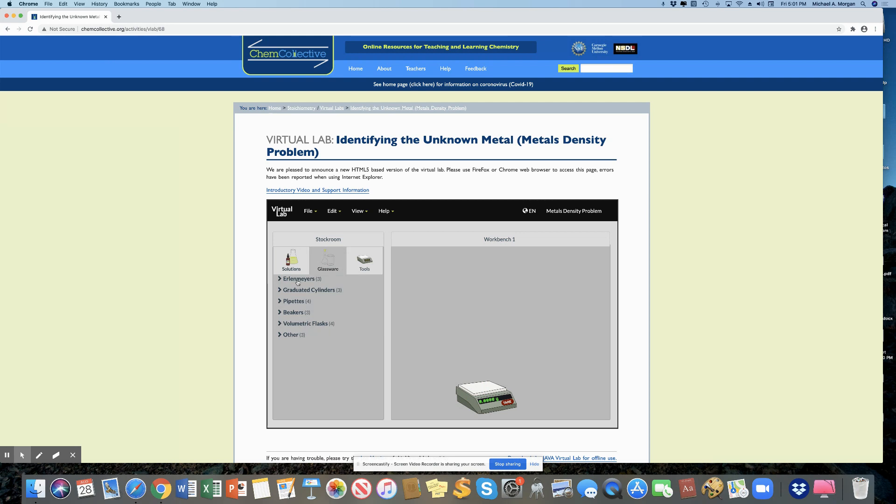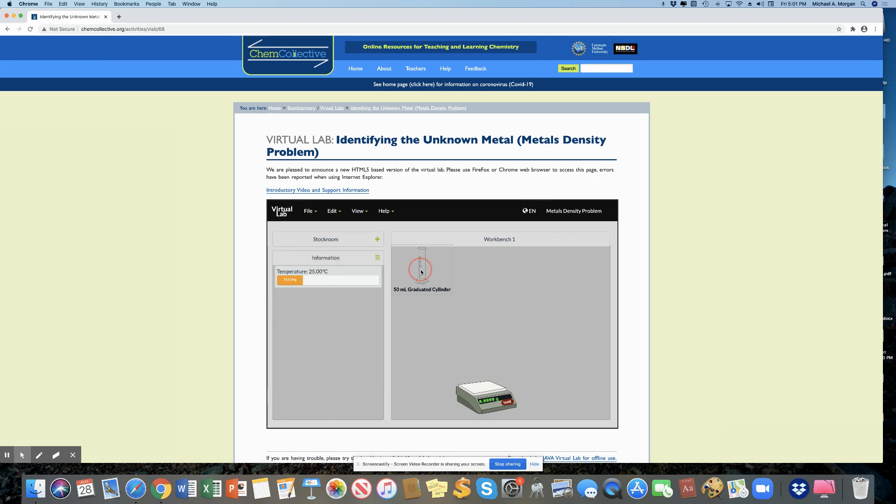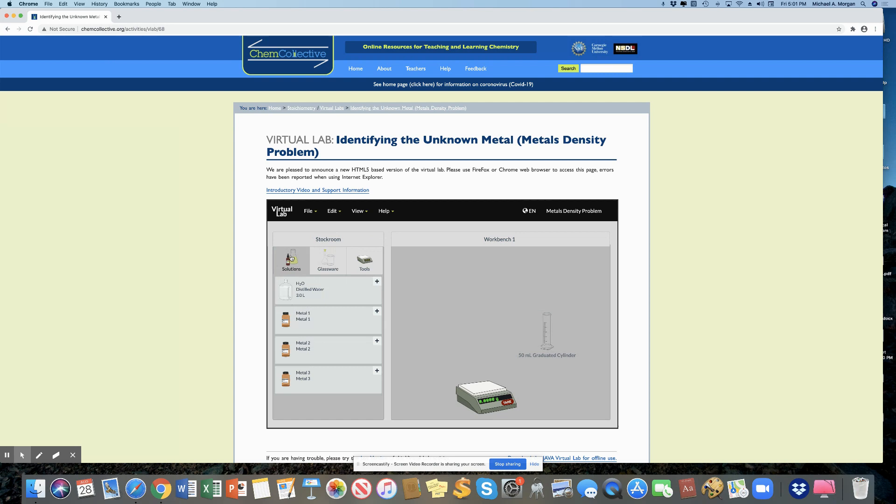Under glassware, I'm going to choose a 50 milliliter graduated cylinder. Click back on stock room again. And under solutions, I need to choose a metal.